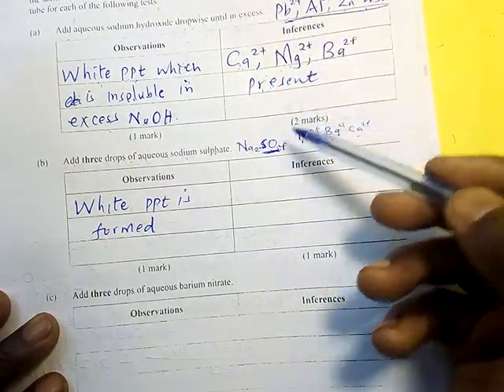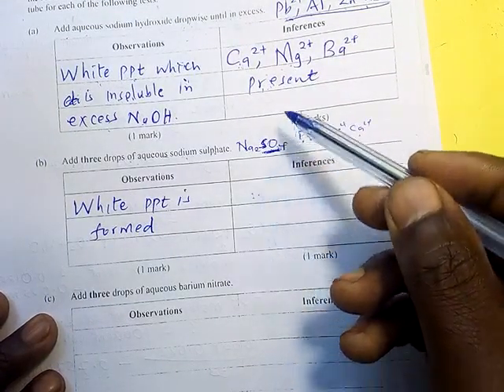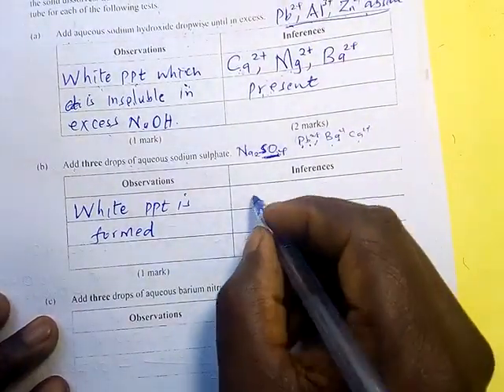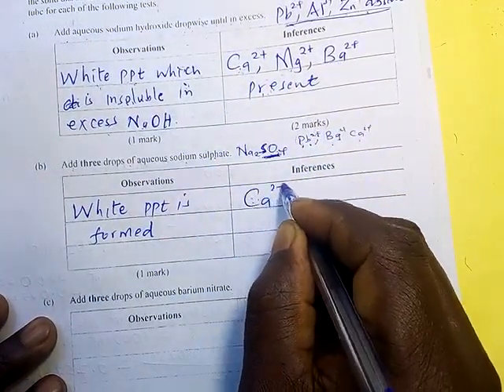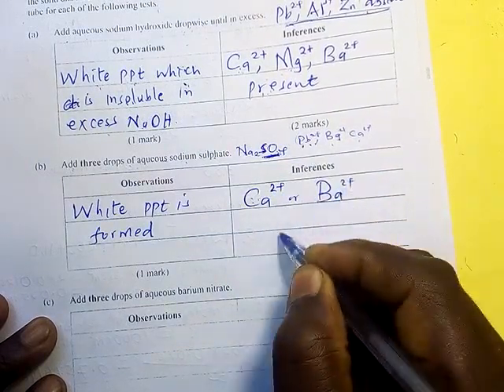So where will you get it from so that you can put it here? Therefore, you don't add that because it was not there initially in the previous observation. Therefore, here it is only calcium and barium that are present. Calcium 2 ions or barium 2 present.